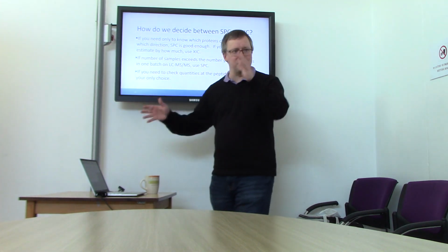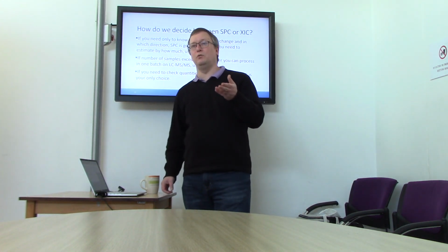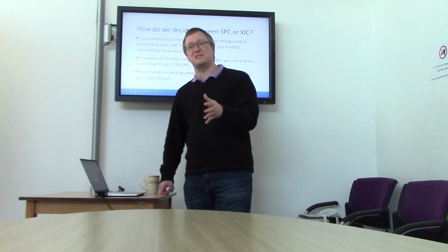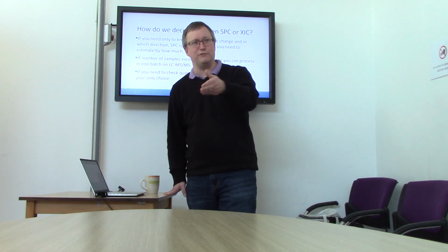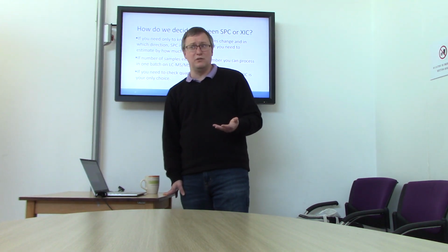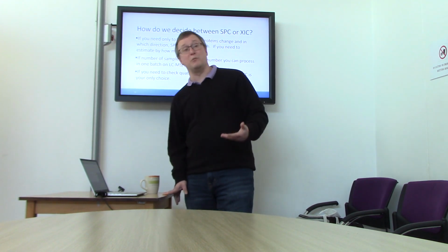So I hope that these are useful for you in trying to evaluate which track you want to go with for the data set. I just want to point out that if you read a paper by somebody in proteomics that you really respect and you think this data set's really cool, and they did their analysis with XICs, there's nothing that prevents you from downloading those data and doing a spectral count-based analysis on it too. Most authors, as I've said, are going to use what's familiar to them, not necessarily the tool that you are most comfortable with.